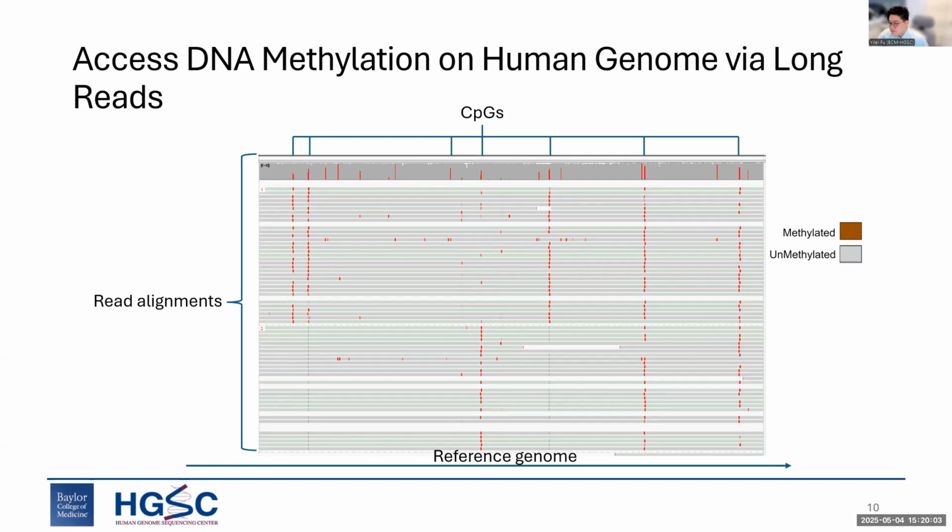Here, we have seen many papers, even before the fast development of long-read sequencing technologies, that use the measurement of DNA methylation to, for example, correlate with transcription, disease, aging, or lifestyle differences. However, these tests could be performed even without long-read sequencing technologies, which raises our first question: how could we actually use the DNA methylation signal that we read from long-read sequencing other than just measuring?